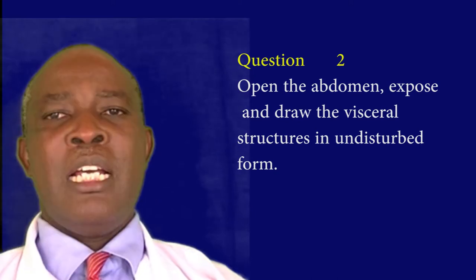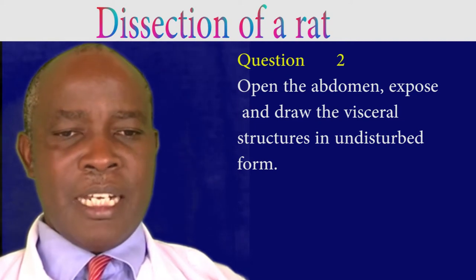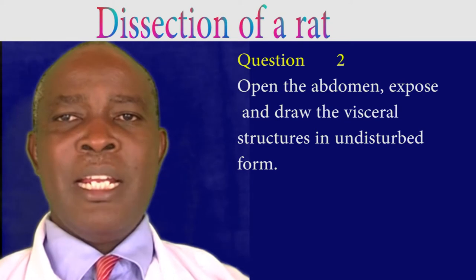Question 2. Open the abdomen, expose and draw visceral structures in undisturbed form. You open the abdomen like this.